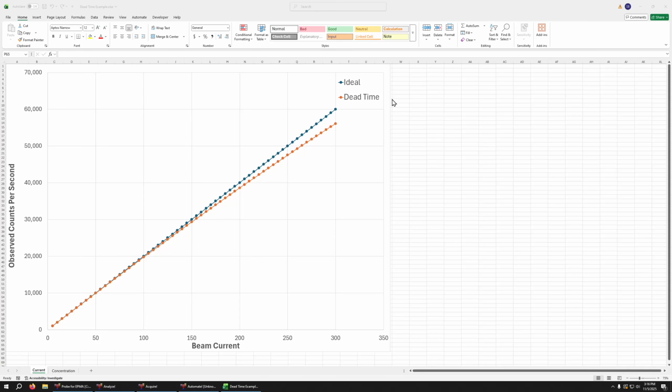This video is going to be about assessing and adjusting your dead time constants in Probe for EPMA using the constant K ratio method. So dead time is simply when the detector is busy, so to speak, and unable to count an X-ray because it's currently counting one.